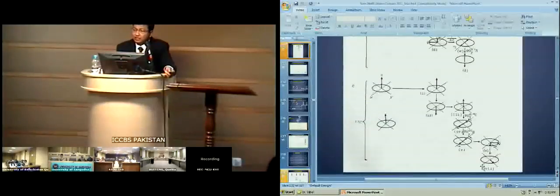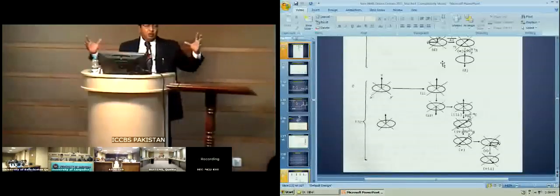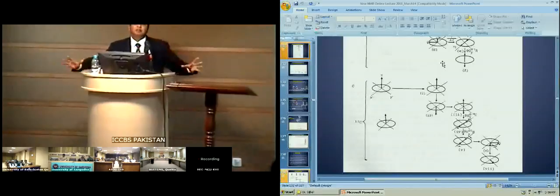This is your signal, which is enhanced by a factor of that, and this is called selective population inversion. If you have a big molecule and you are transferring the population of one selected proton to one selected carbon, it is called SINEPT, selective insensitive nuclei enhancement by polarization transfer. You can do that. An amazingly powerful technique which I use to the limit.